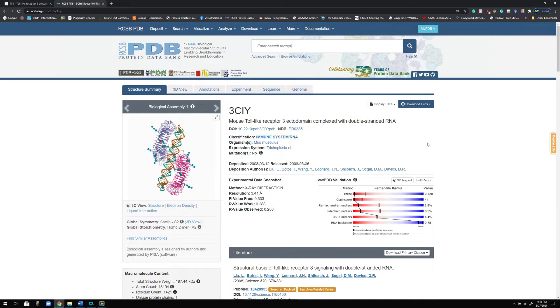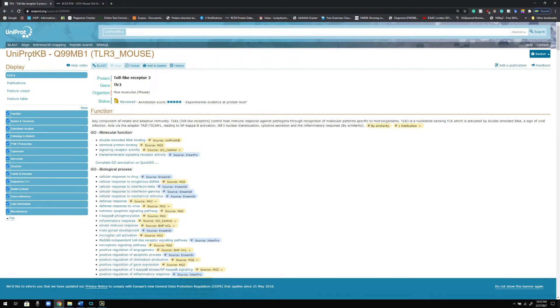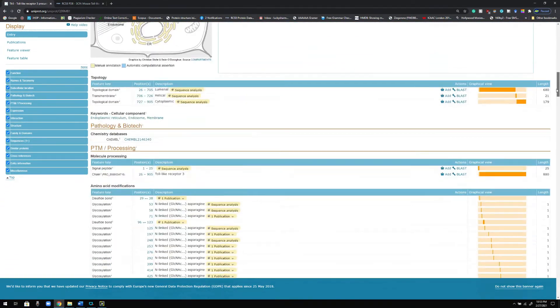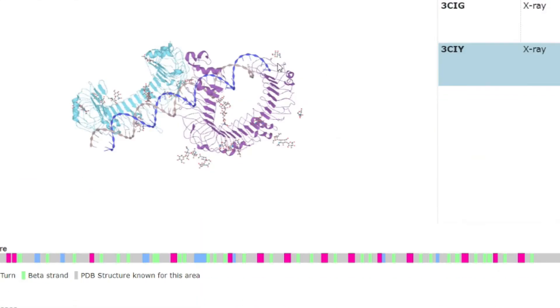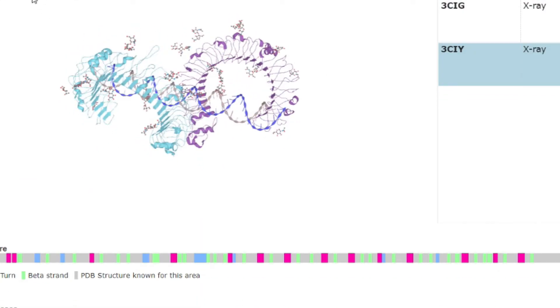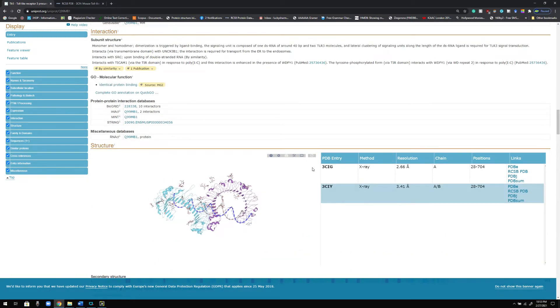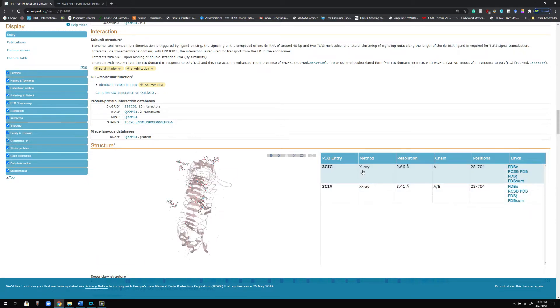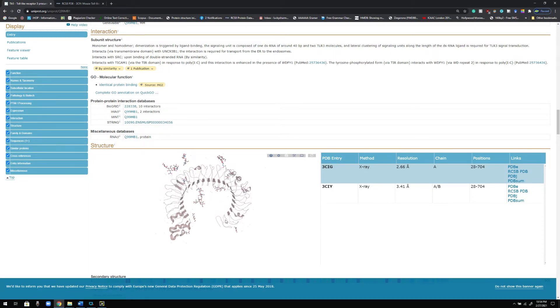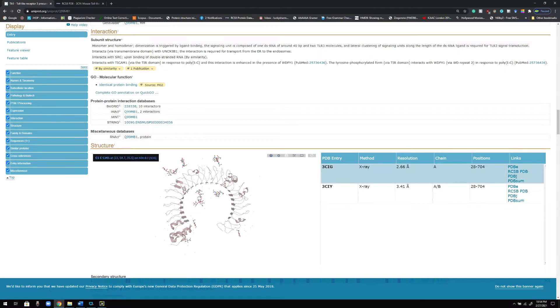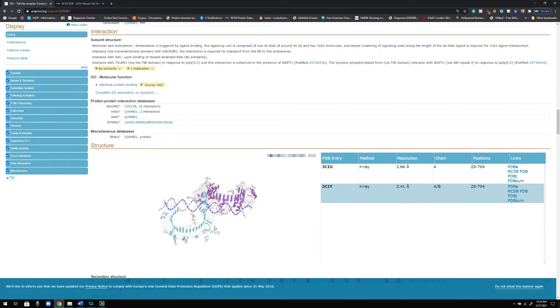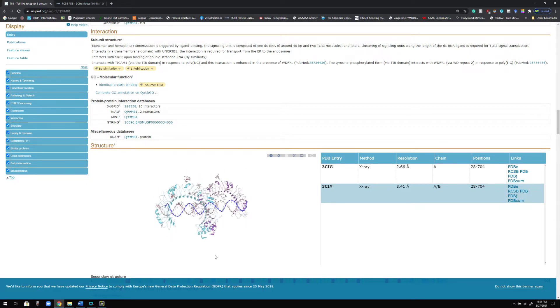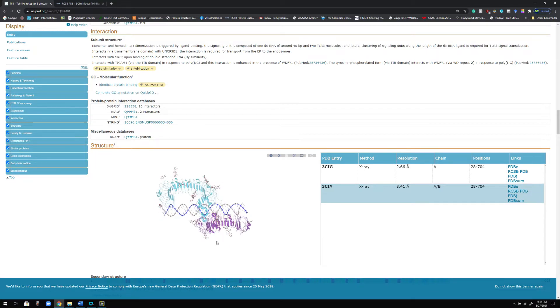That is one way to get the FASTA sequence. The second way is you can go to the UniProt website, type Toll-like receptor 3, and visit this page. If you scroll down you can see the structure I was talking about. UniProt also gives you other available structures — for example, there is a monomeric structure not complexed with double-stranded RNA. I can use that structure if I want to analyze monomeric Toll-like receptor 3, or the other one for the dimeric form.